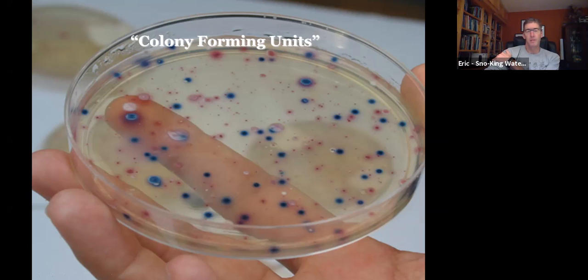This is an example of an incubated petri dish of water and media where the E. coli colonies react with an enzyme and turn blue, and other coliform bacteria colonies result in a pink color. We'll talk about how you count them, but essentially you identify the number of those dots that are big enough for you to count and come up with a number of colony forming units.